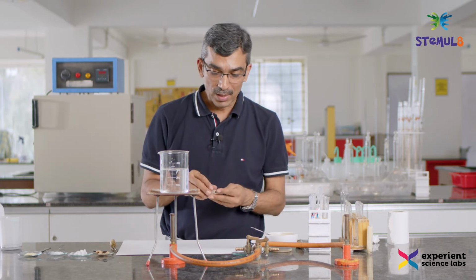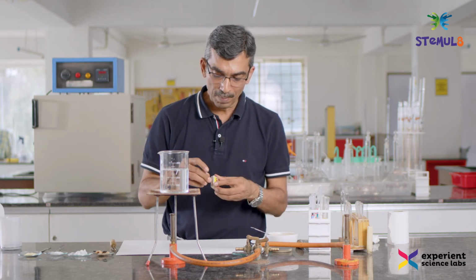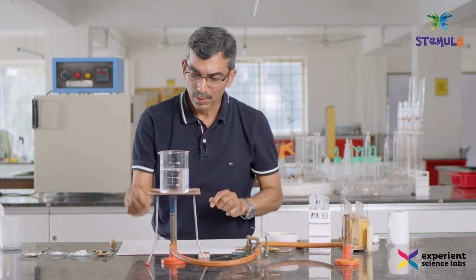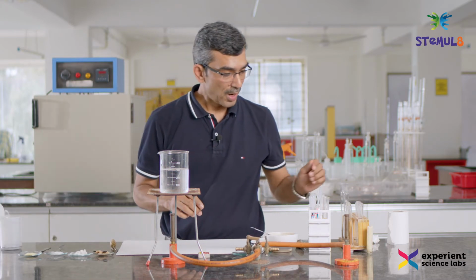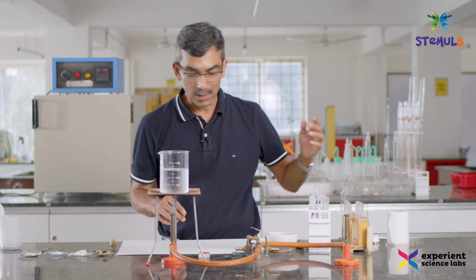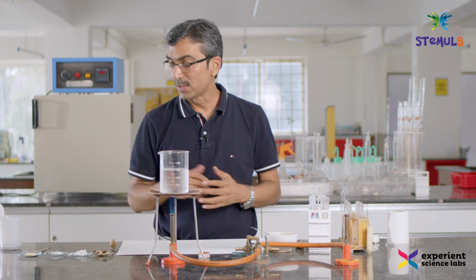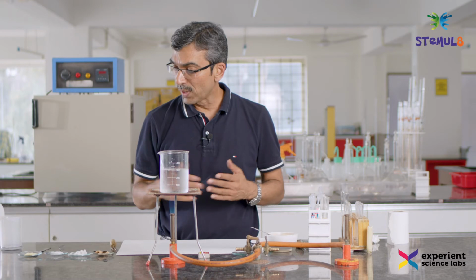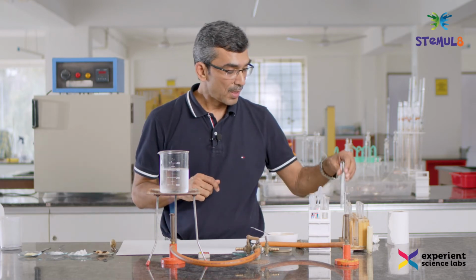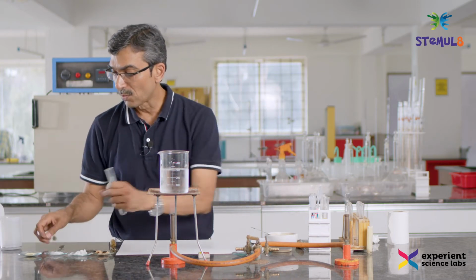So let me heat the water and start the process. Okay, and we will take a couple of ingredients for this. One obviously is sugar, because we want to use that as a reference source, and among other things I would go with moong dal this time. That has not been tested, and we will see whether that has sugar in it. So I will take a bit of moong dal.